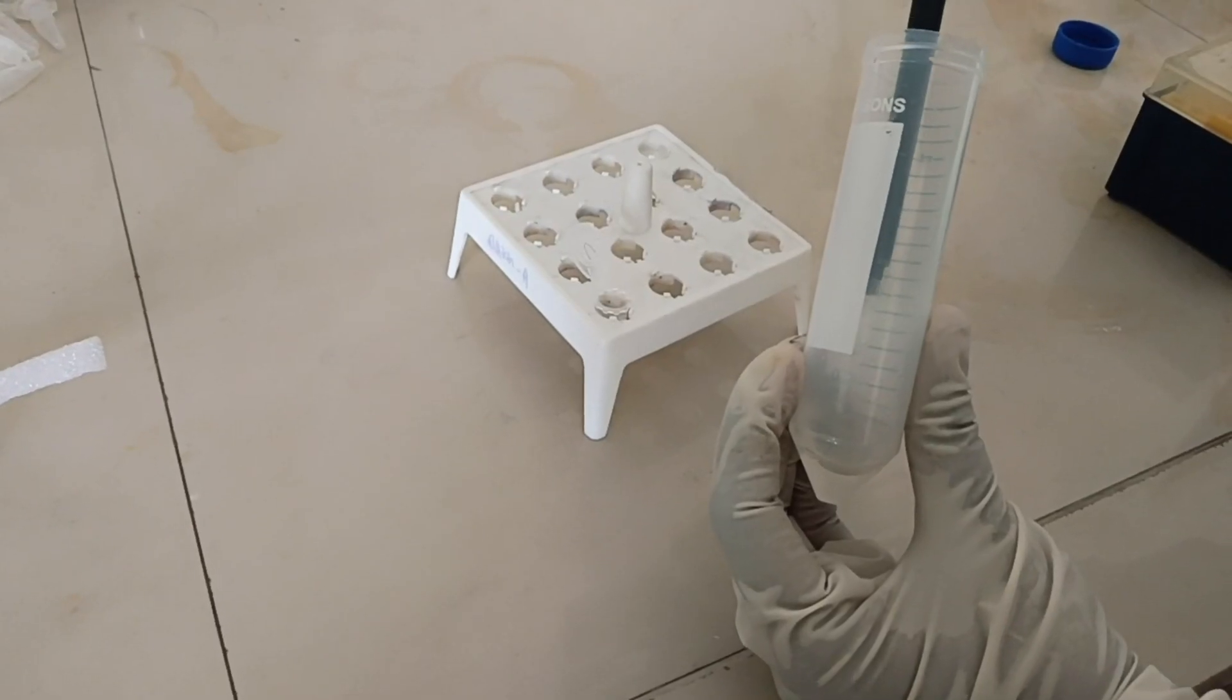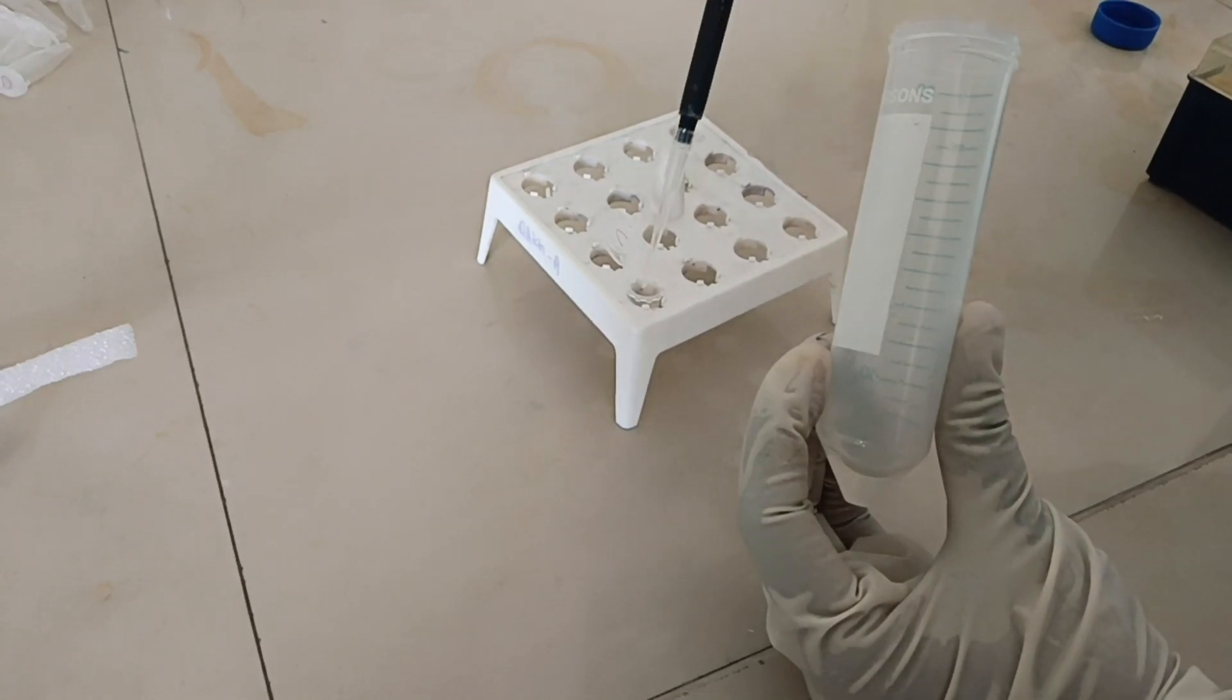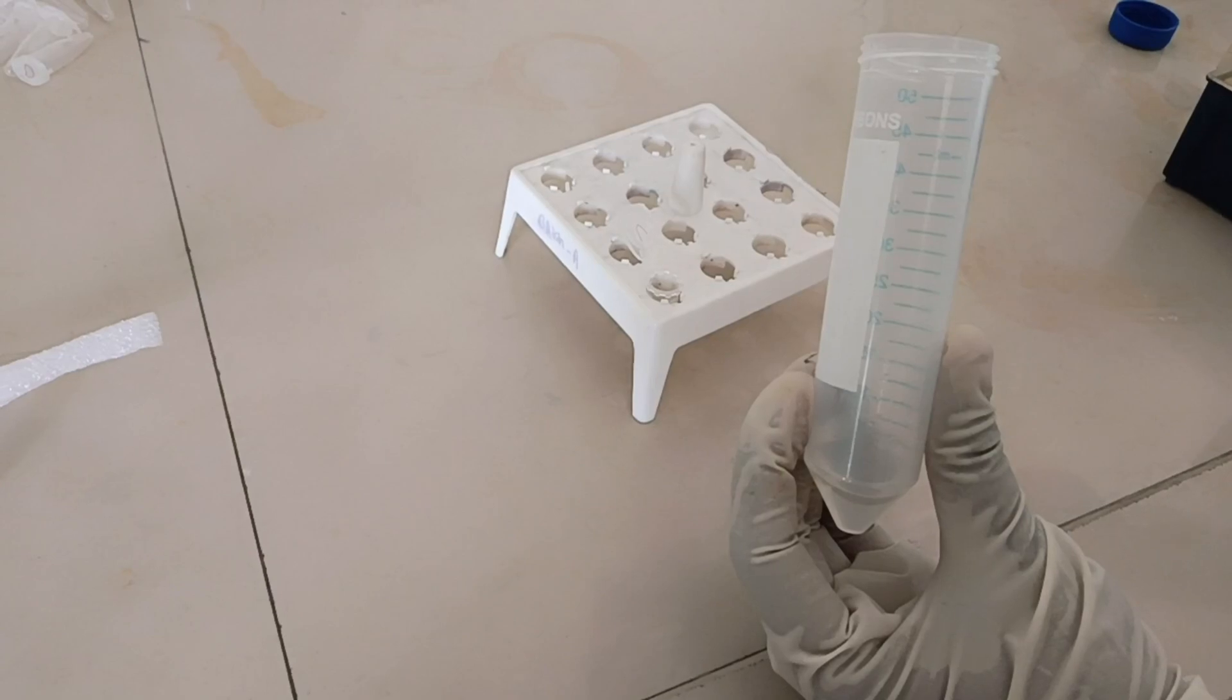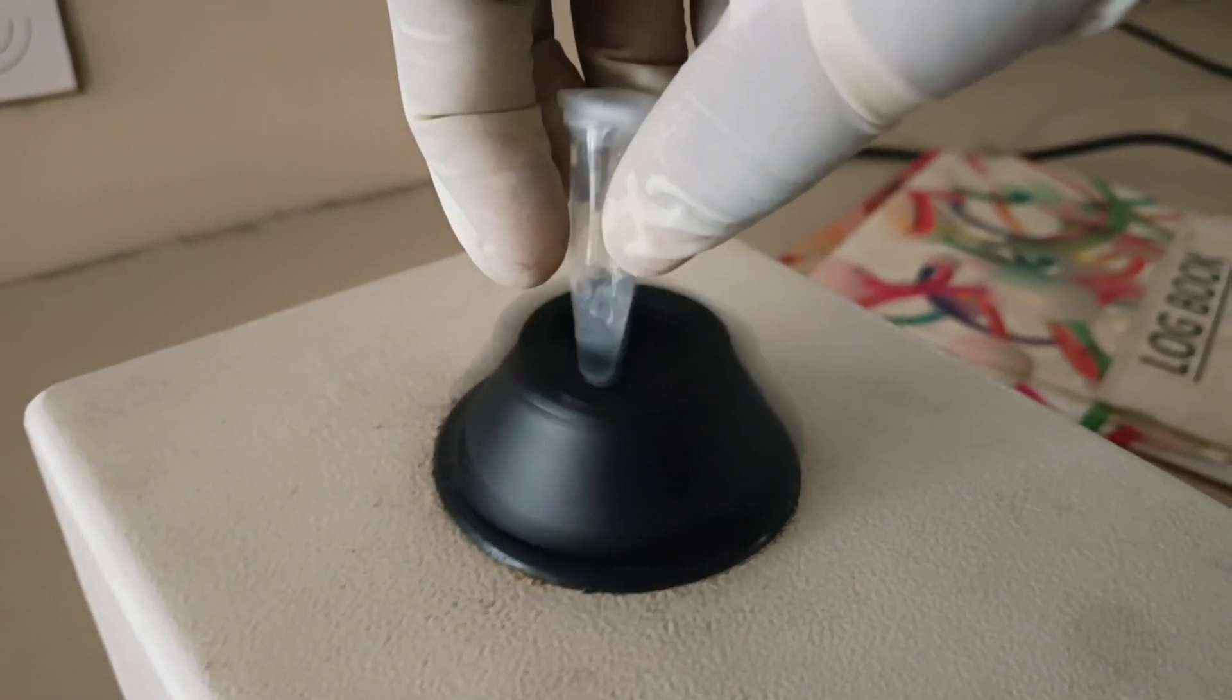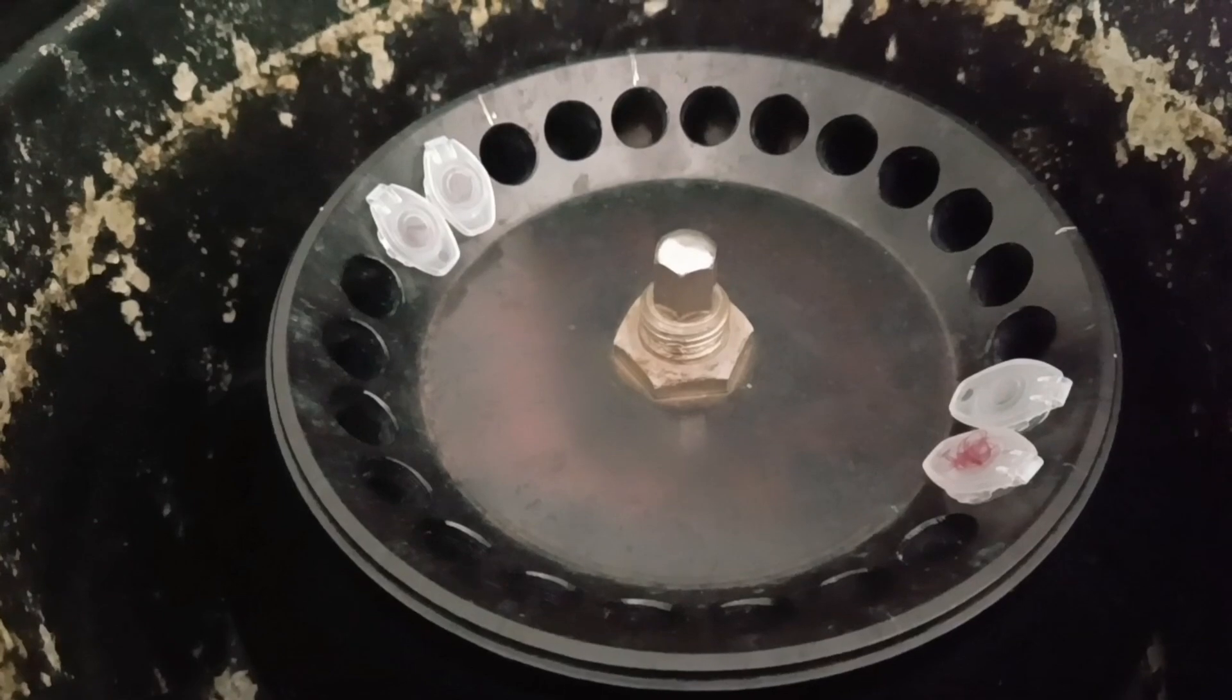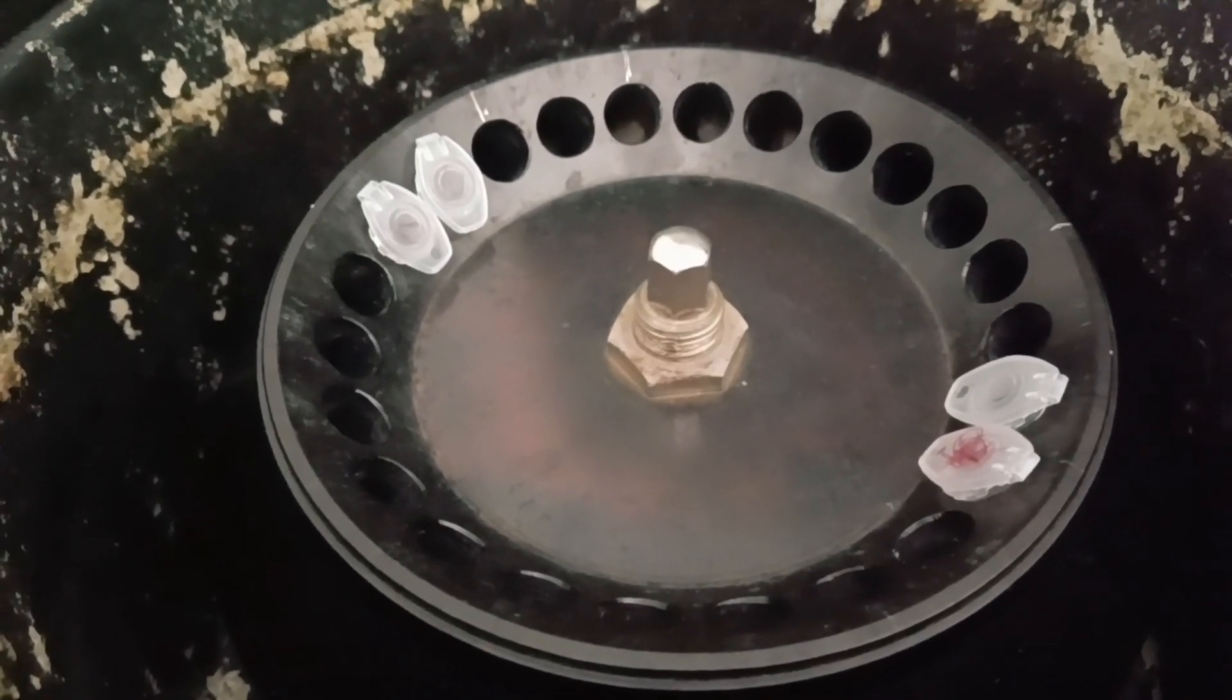After 1 hour of incubation, add equal volume of PCI, i.e. phenol chloroform isoamyl alcohol. Vortex the tubes until it gets completely mixed. Centrifuge the tubes at 10,000 rpm for 10 minutes.